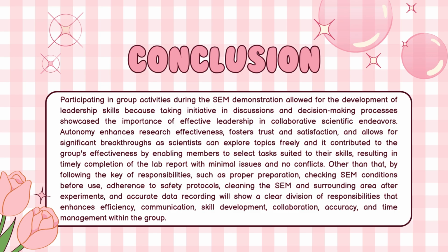Other than that, following the key responsibilities, such as proper preparation, checking scanning electron microscopy conditions before use, adherence to safety protocols, cleaning the scanning electron microscope and surrounding area after the experiment, and accurate data recording, will show a clear division of responsibility that enhances efficiency, communication, skill development, collaboration, accuracy, and time management within the group.